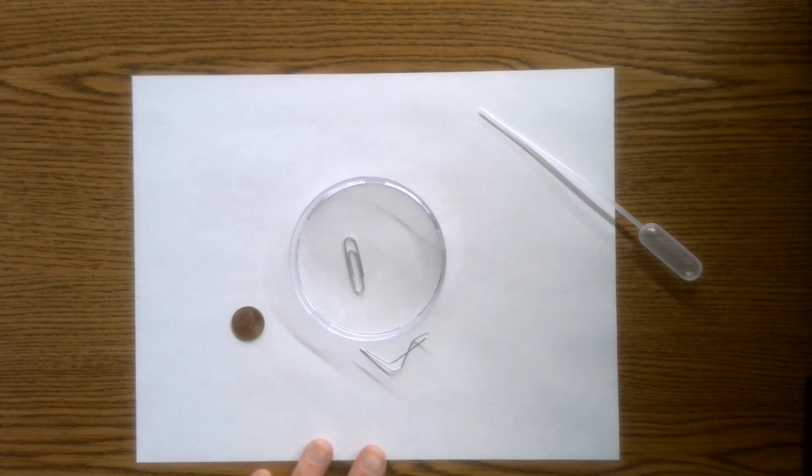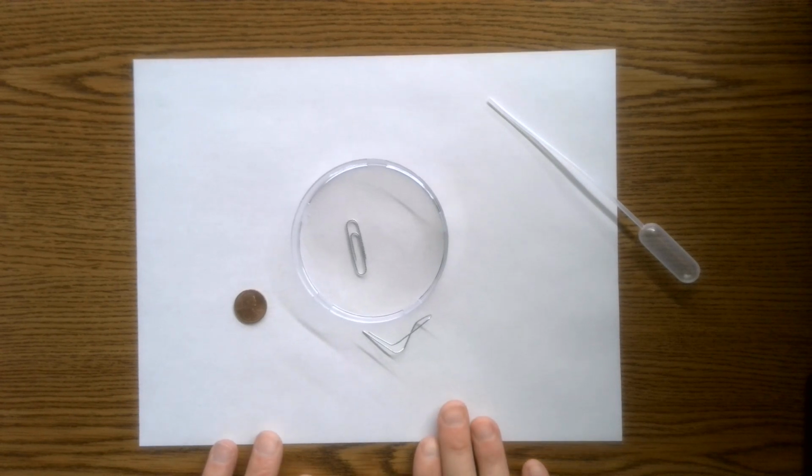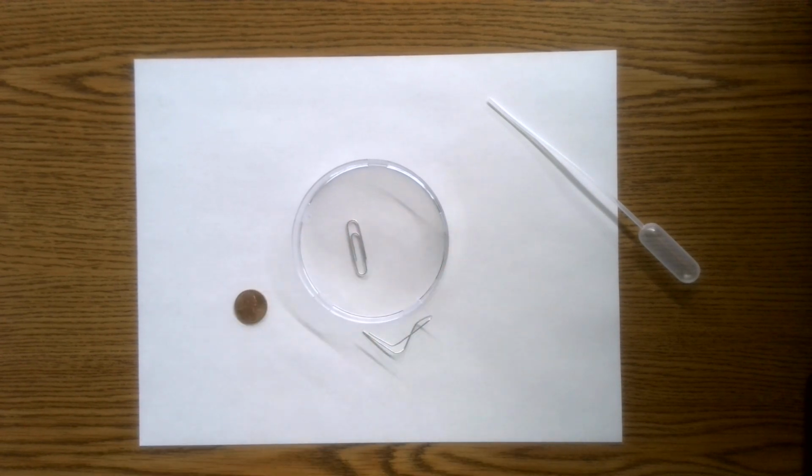Important note to this is kind of like skeeter bugs, how they sit on top of the surface of water. That's why we don't put soap, okay, in the rivers. If we put soap in the rivers, aquatic life would die because they can't sit on the surface of water. Okay, all right, so we're just exploring the phenomenon.